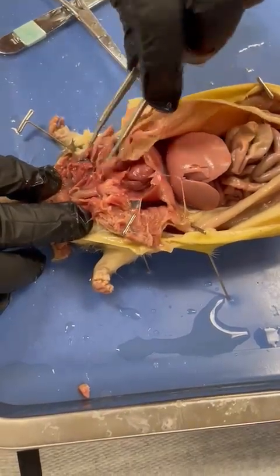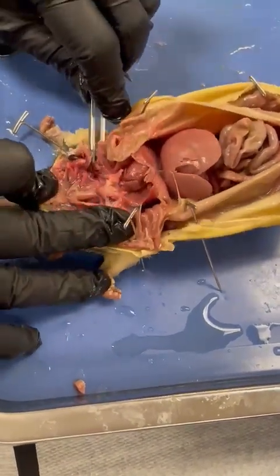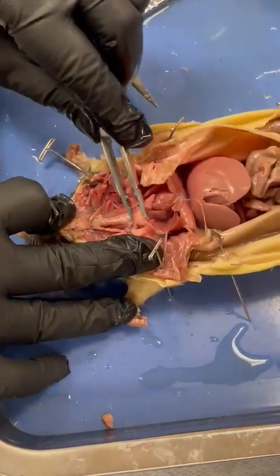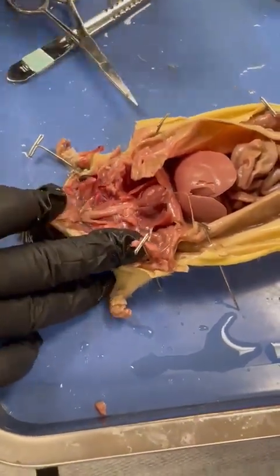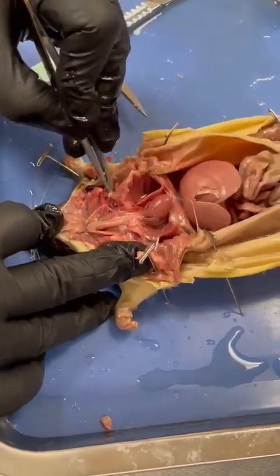That's the esophagus. That's the trachea, which is above. Okay, so that is the trachea. Trachea goes to the left lung.